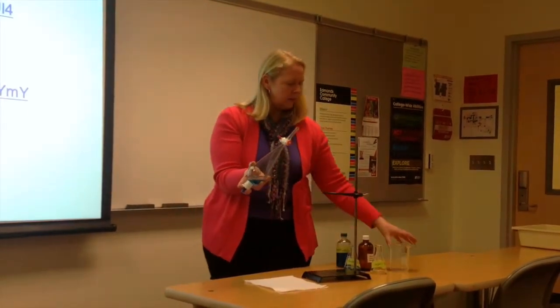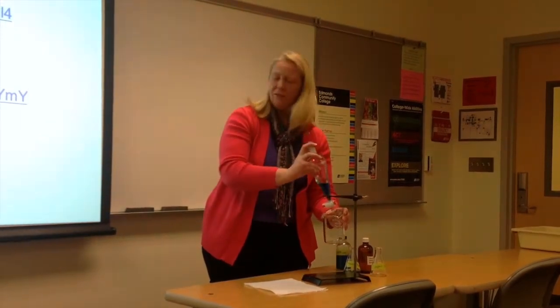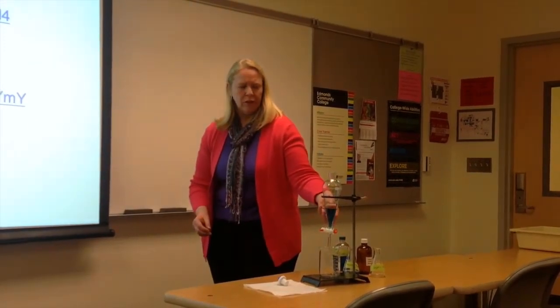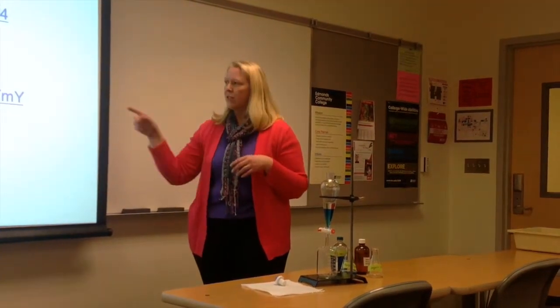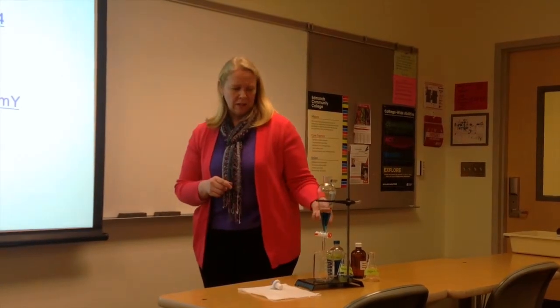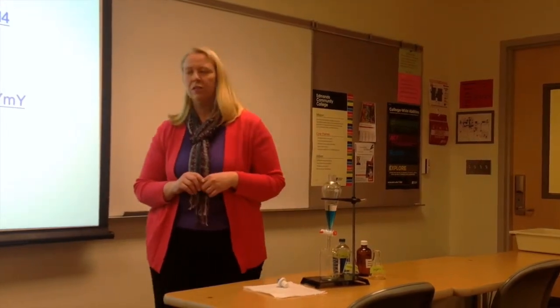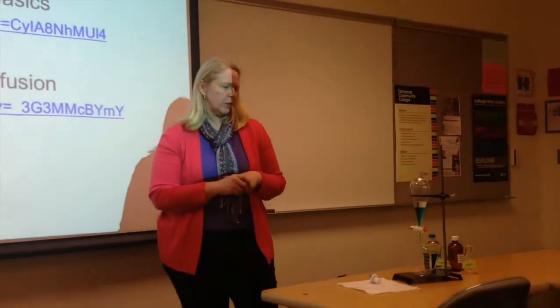So that's something you want to avoid, and the second video shows it very nicely, how you can get an emulsion. And this is really just a colloidal mixture of the two solvents that won't break up very easily. And there's various tricks that they talk about that you can use. So at some point you're going to encounter that and need to be able to separate those two. A lot of times just rocking gently and waiting if you do get an emulsion is all you need. So that is the basic concept on how this works.